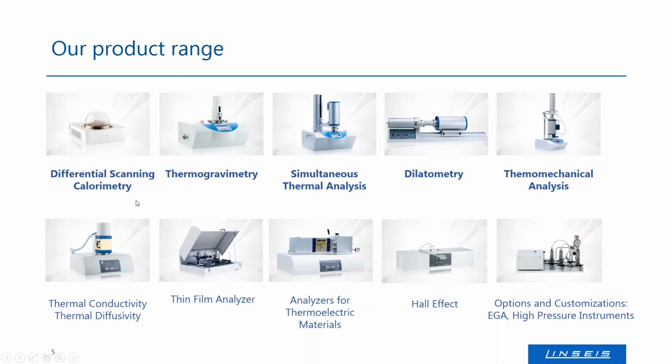And as you can see, the line above here is written in bold letters because these instruments, so DSC, TG, STA, dilatometer, TMA, are the instruments that can be equipped in general, or where it makes sense to be equipped, with water vapor and humidity generators. So these instruments are what I'm talking about in the coming slides, talking about humidity and so on. These are the instruments where this makes sense and where this is applicable. For thermal conductivity, thin film and so on, we have not yet used humidity generators, because here it's not requested and doesn't make too much sense.